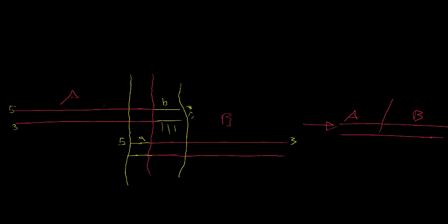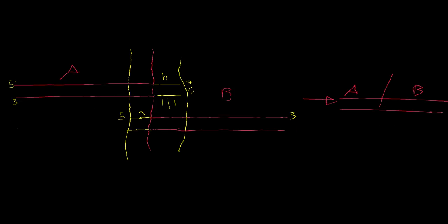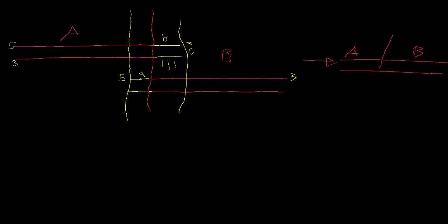So now you can see that we have our fragment A, we have our fragment B, but we've added a little bit of B onto A and a little bit of A onto B. Let's not worry about how we get that for now, but just conceptually, we're going to pretend that we have this scenario. So if we were to put these together in a PCR tube, and we were to start melting our DNA, so our PCR is going to go up in temperature until all of our DNA melts apart. It all denatures. We're going to see that our fragment A is going to maybe come apart.